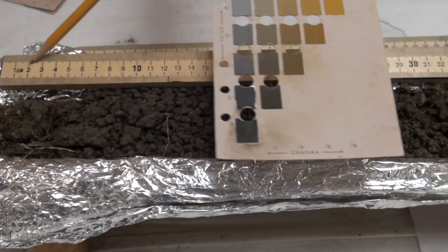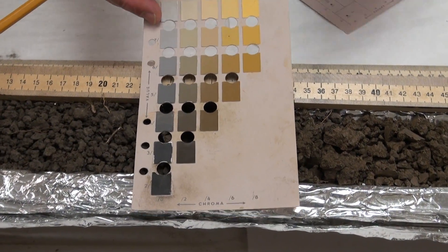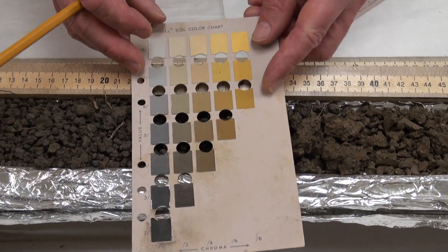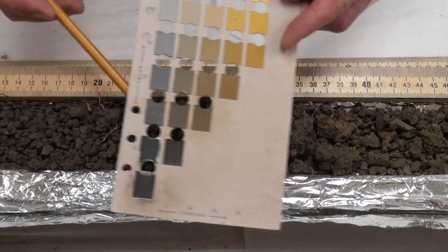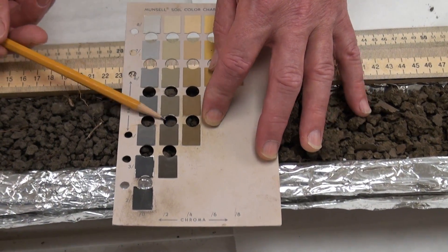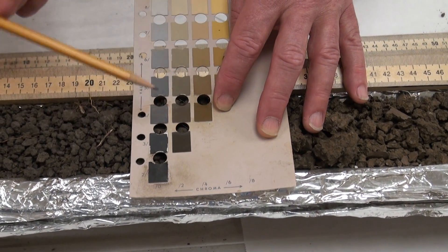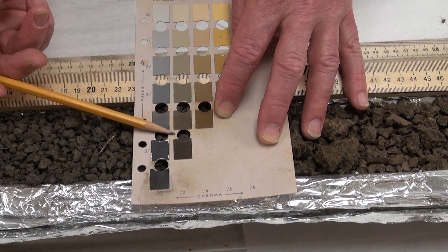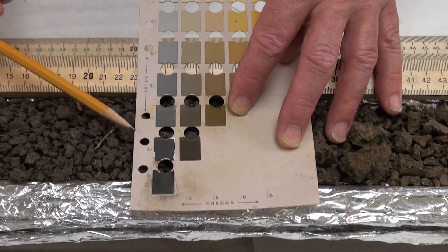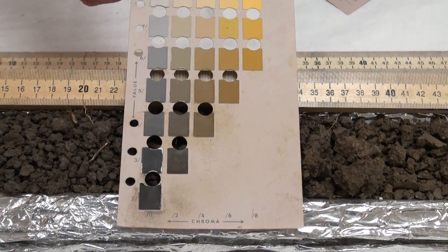Moving to 25 centimeters — not a lot of change. We're getting farther down the profile, and this one is going to be darker than 5. Pretty close right here maybe. Not a lot of difference from above. I'm going to say again 2.5 Y, value 3, chroma 2.